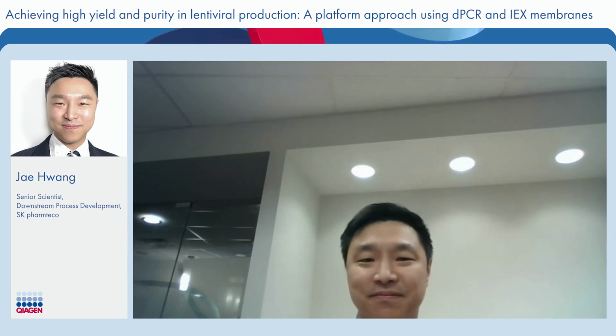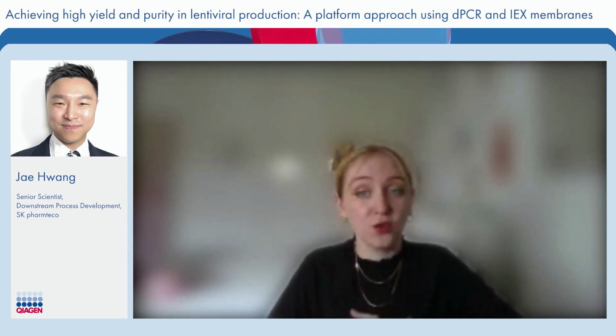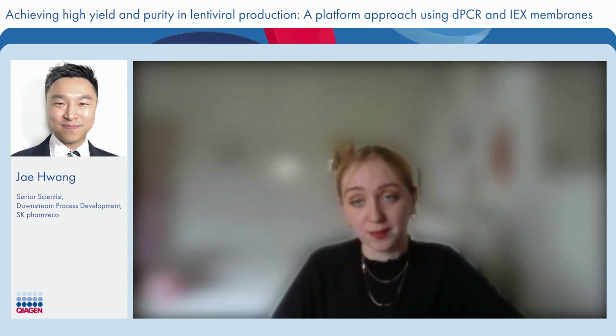Amazing, thank you. And I think we have time just for one more question. Are there any important considerations for controlling temperature and lentivirus in these processes, or is this mostly circumvented by speeding the process up and making it as fast as possible at room temperature?